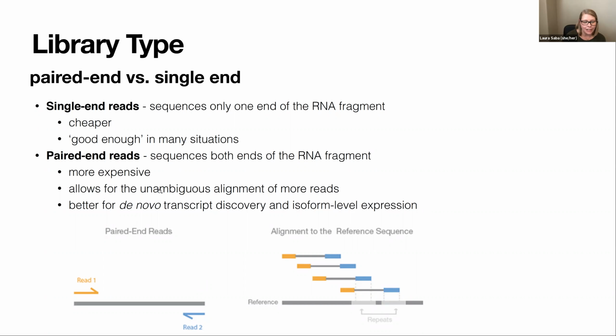In a paired end read, we're taking that piece of RNA and reading from both ends. So not only do we see how well read 1 aligns to the genome, and how well read 2 aligns to the genome, but we can also double check that alignment and see if it makes sense where these two were aligning, because they came from the same piece of RNA.